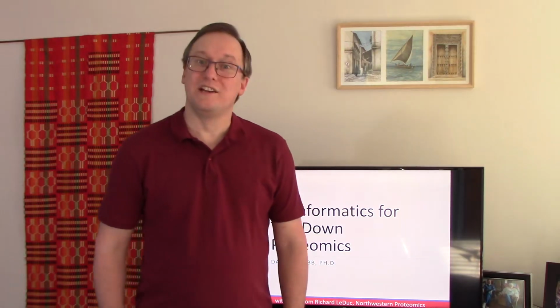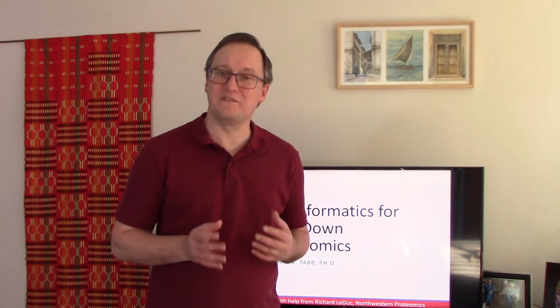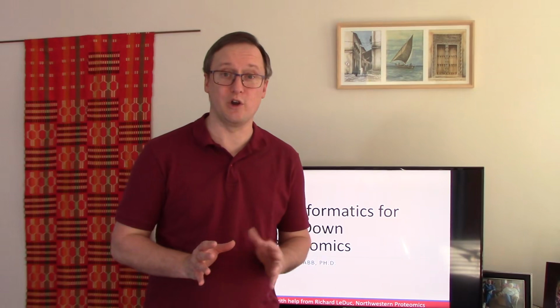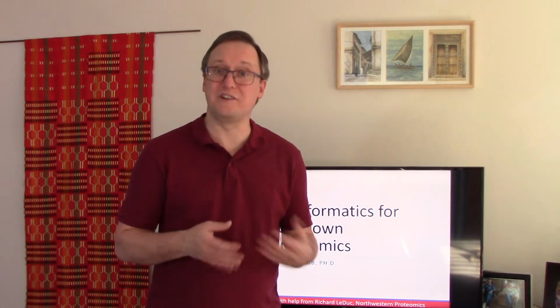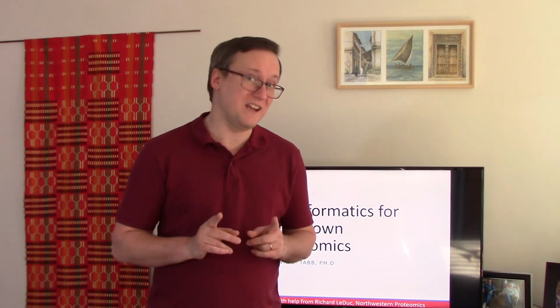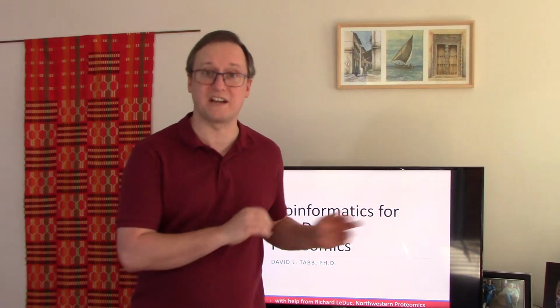Good morning. Today we're going to learn a little bit about top-down proteomics. I've spent 20 years in the field of proteomics, and I've spent almost all of it on shotgun proteomics, or bottom-up proteomics, where we deal with the peptides we've digested out of proteins. But in this case, we're going to turn the table on its head and instead speak about top-down proteomics, the analysis of intact proteins.